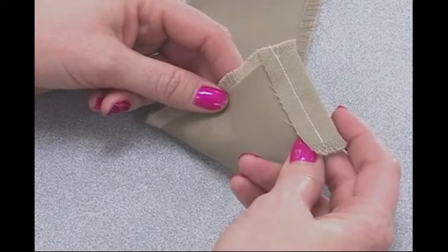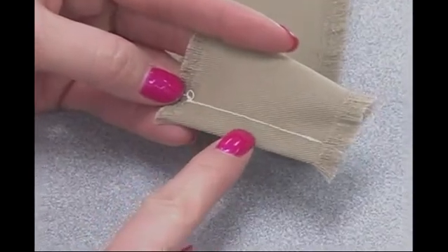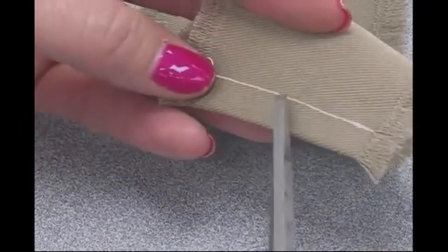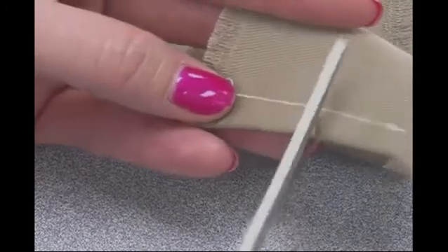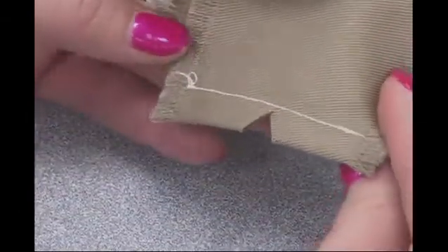The next step of specimen preparation involves turning up a 1.25-inch fold on one end of the specimen and sewing a line across the specimen 1 inch from the fold. Then, in the middle of the fold, a 0.375-inch notch is cut away, leaving an opening into which a dowel pin can be placed and onto which a tension weight can be applied to the specimen.